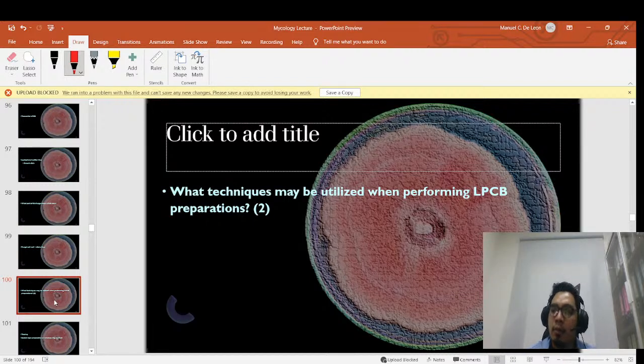After that, you get another needle, and you tease it whilst mixing it with lactophenol cotton blue. And the famous one is what you call the scotch tape or the cellotape flag method, wherein you put a piece of scotch tape on a piece of pencil or whatever, and then you touch the outer portion of the fungus, and then you put it on the slide with lactophenol cotton blue.